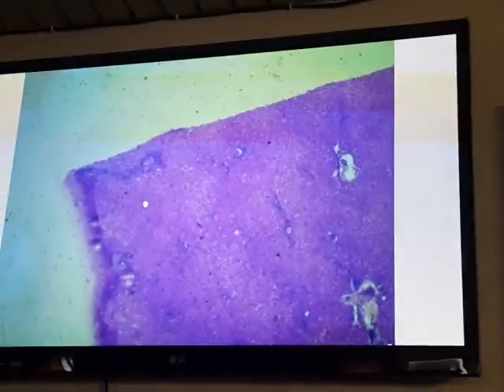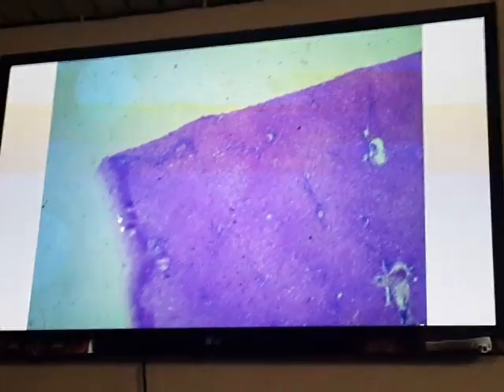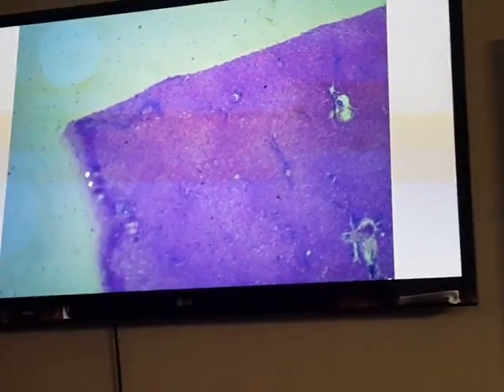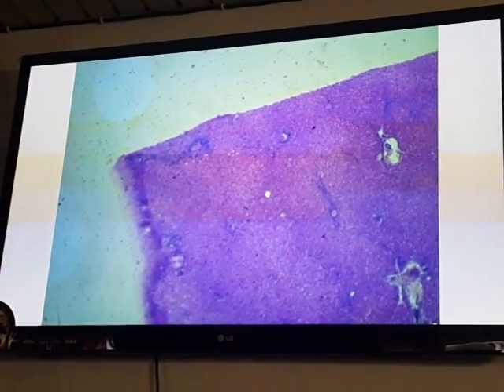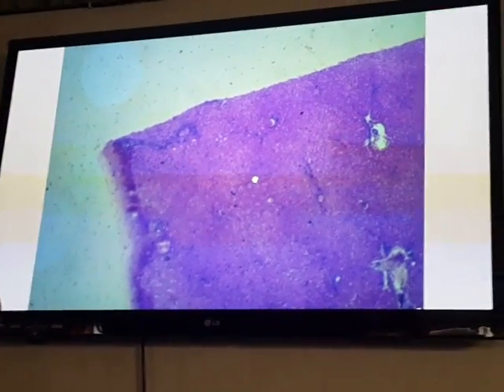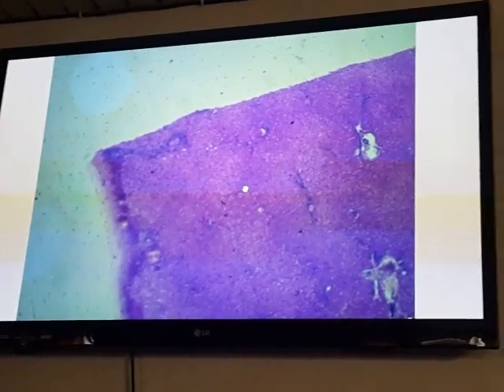First slide, the section in the liver. The liver is covered by thin connective tissue capsule called Glisson's capsule. The structural unit of the liver is called liver lobule. Liver lobule is a polygonal mass of cells with 3 to 6 portal spaces at the periphery.